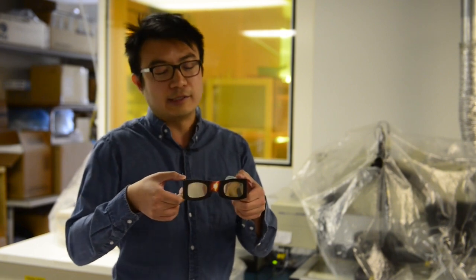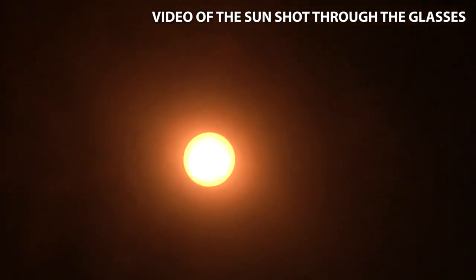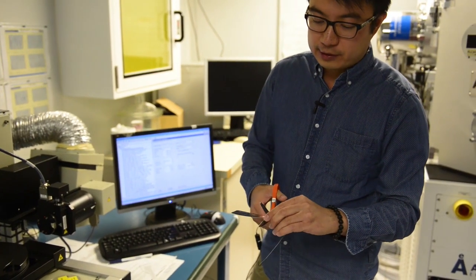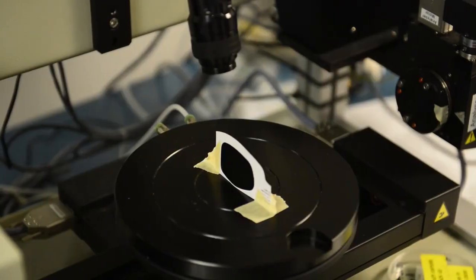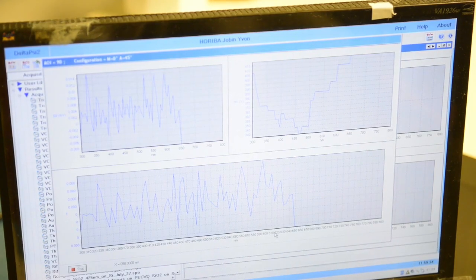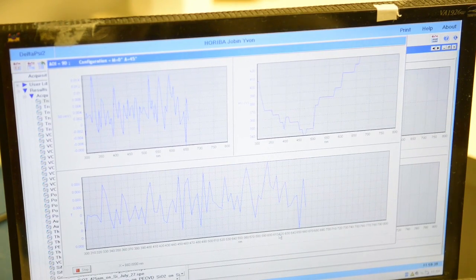But when the sun is directly coming into your eyes, this will actually block the light by up to five or six orders of magnitude. We're scanning from wavelength 300 nanometers to 800, which is roughly the visible range. What we're seeing is almost zero transmission across the entire visible wavelength, which means it's entirely blocking out the sunlight and only allowing very little to go through.